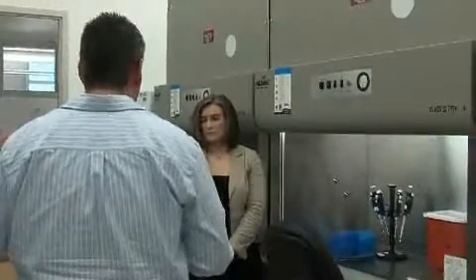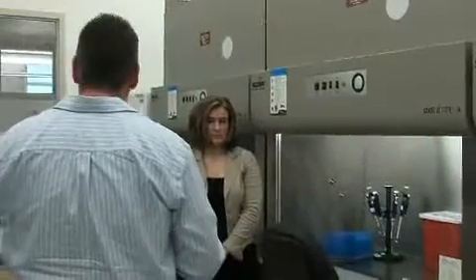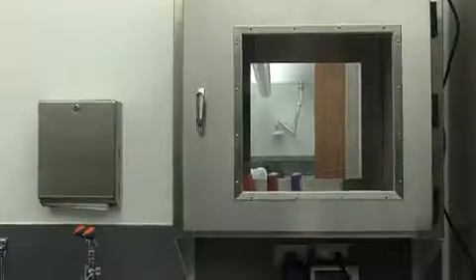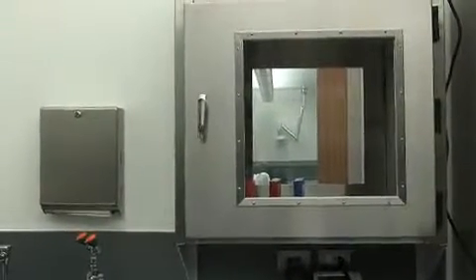And then once they've run those samples, all of the material that's used in here, such as the trays, can be put back through the other pass-through and actually UV. And the UV actually breaks down any DNA that's present in the samples.